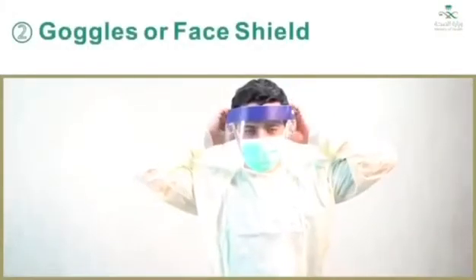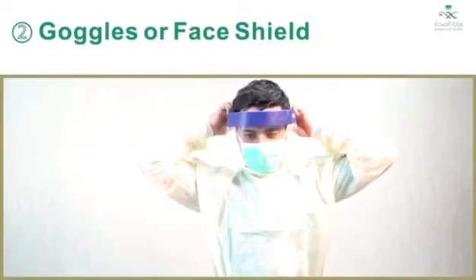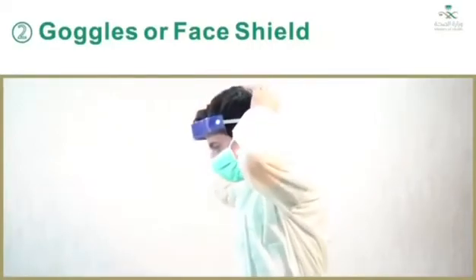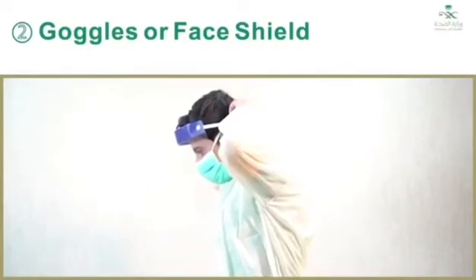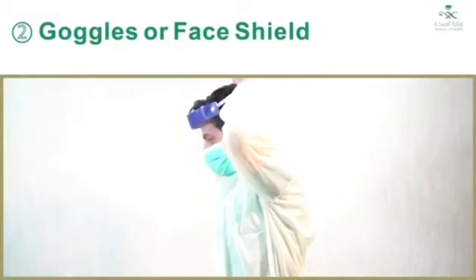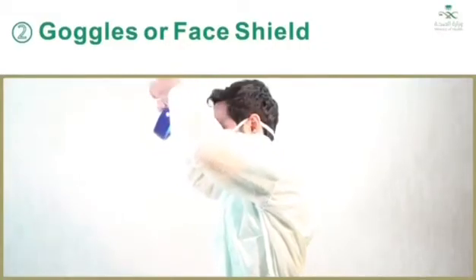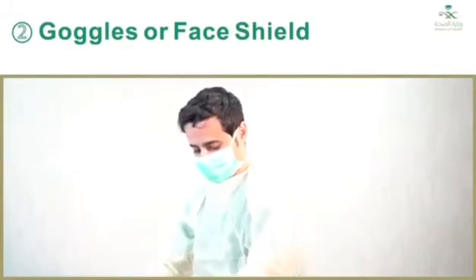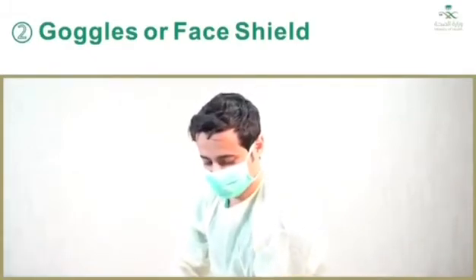2. Goggles or face shield. Outside of goggles or face shield are contaminated. If your hands get contaminated during goggle or face shield removal, immediately wash your hands or use an alcohol-based hand sanitizer. Remove goggles or face shield from the back by lifting headband or earpieces. If the item is reusable, place in designated receptacle for reprocessing. Otherwise, discard in a waste container.